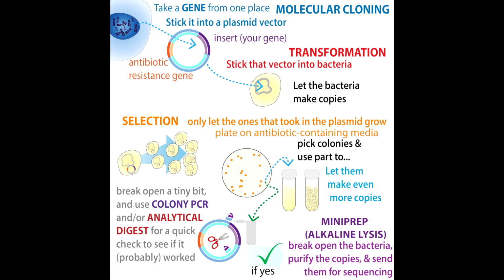So we let them grow a little bit in the tube in the absence of the antibiotic before we even try plating them. So what happens is that you only end up with a few of the plasmid-containing bacteria, and they're scattered all over the plate as long as you did the spreading out well.